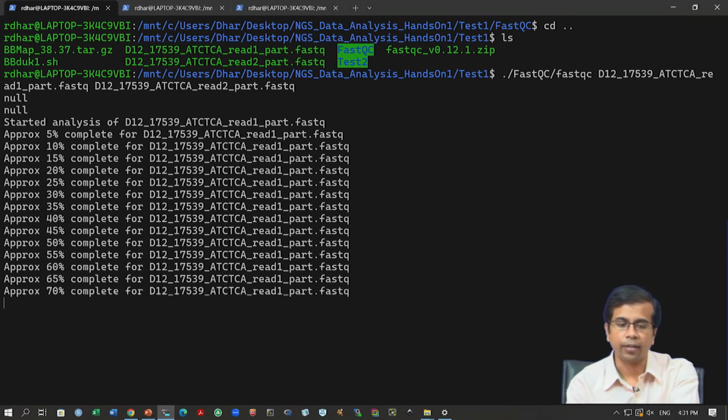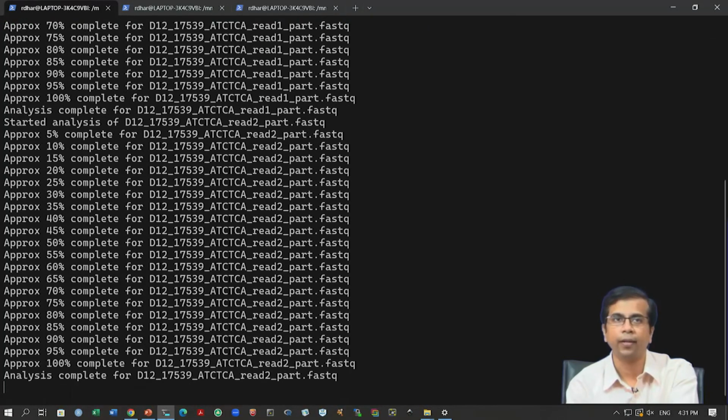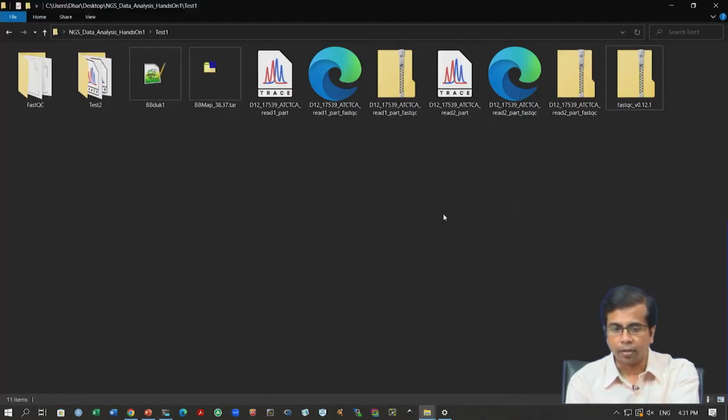Okay. So, we are running this and it gives you an update, right, what percentage of the run is complete, etc., for each of these reads, right. So, once it is done, it will be back here, right. So, this is done now, okay, and we can now go and check the quality score. Okay. So, let us go inside that. So, you will see, right, inside this folder these 4 files will be created. We have run 2 fastq files. So, for each there will be 2 files generated by FastQC.